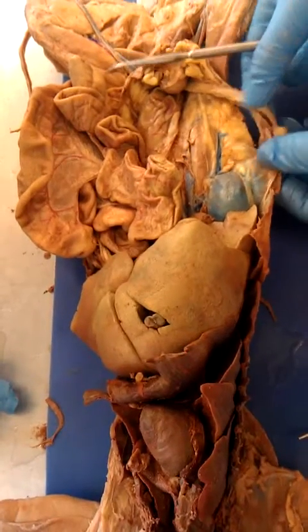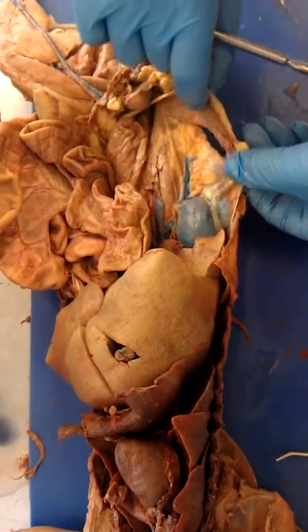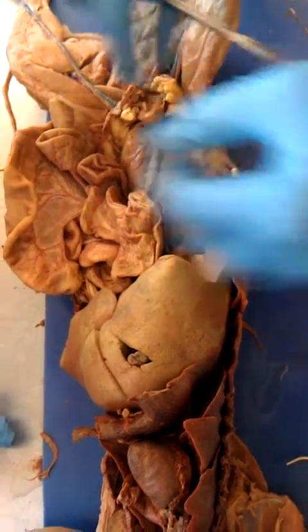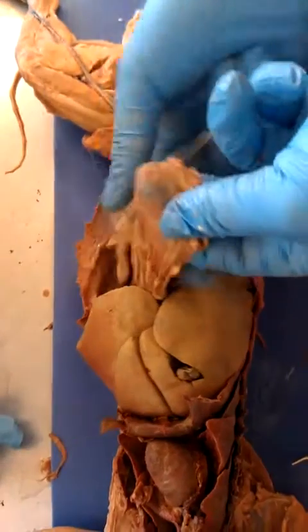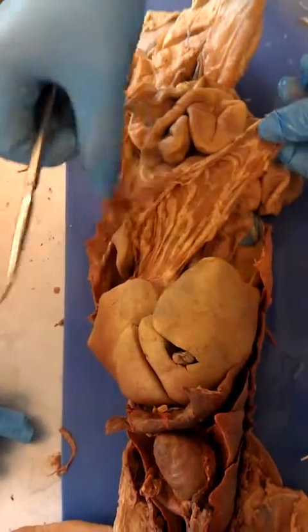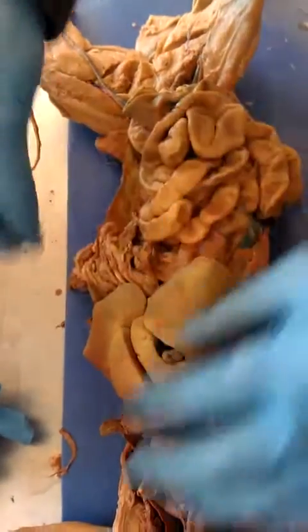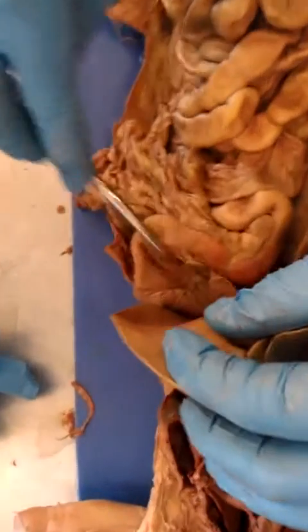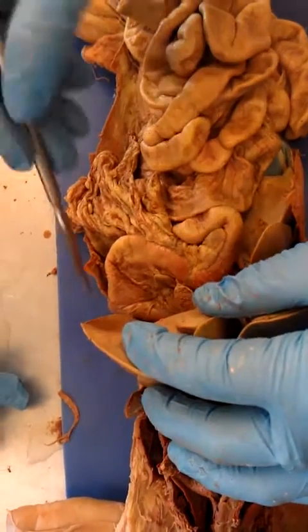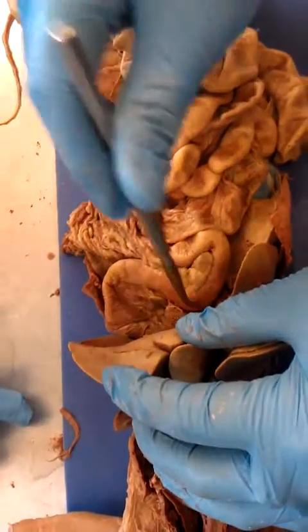The greater and lesser omentum. So this is the ovary, and, no, okay, this is the uterine horn, sorry. The omentums, this is the greater omentum that covers everything, okay? The apron. And then the lesser omentum is right here, within the stomach. And so this is the stomach right here. And this is the greater curvature and the lesser curvature.